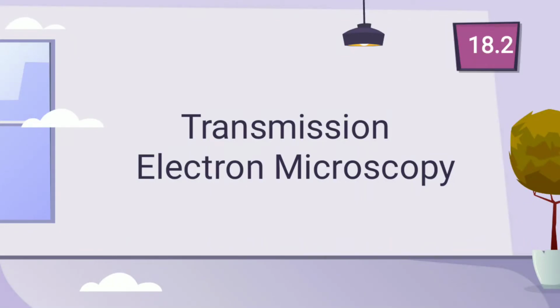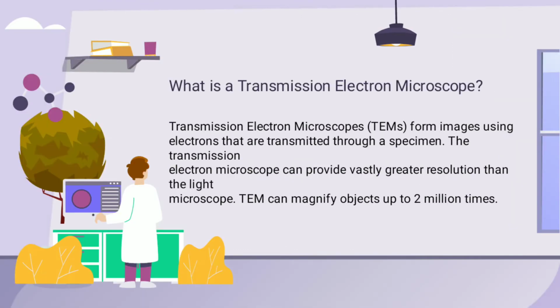Now, let us proceed to our next lesson, 18.2, Transmission Electron Microscopy. So what is a transmission electron microscope? Transmission electron microscopes, or TEMs, form images using electrons that are transmitted through a specimen.